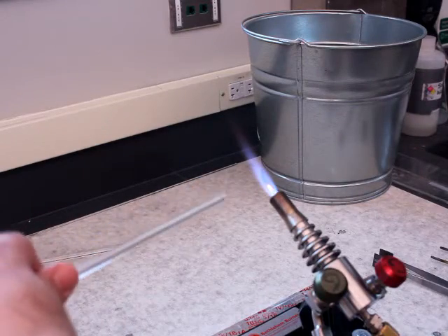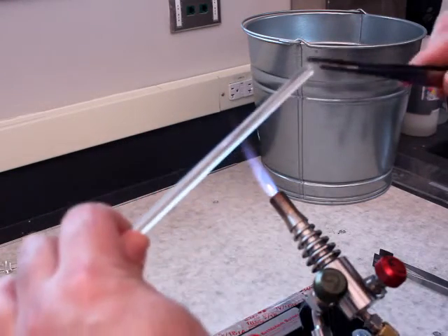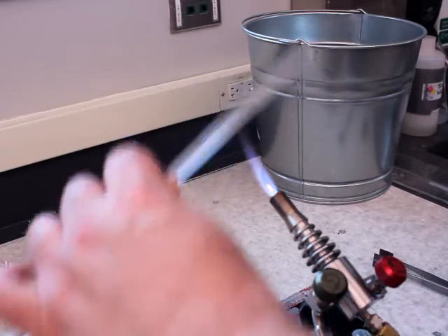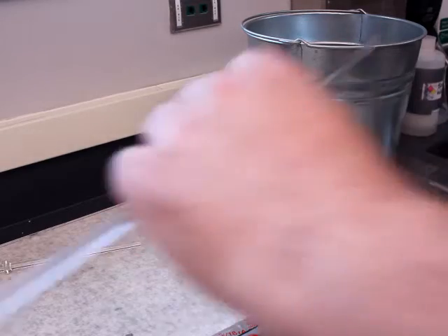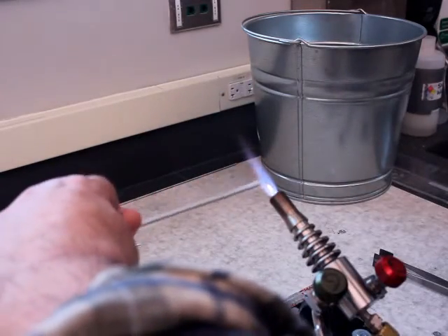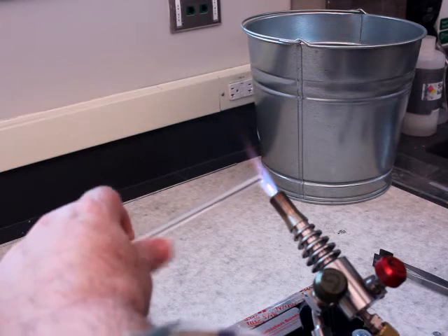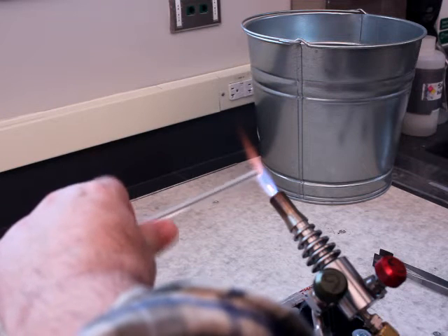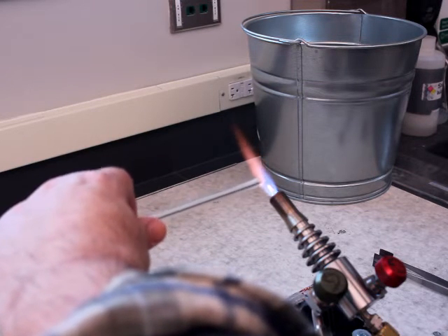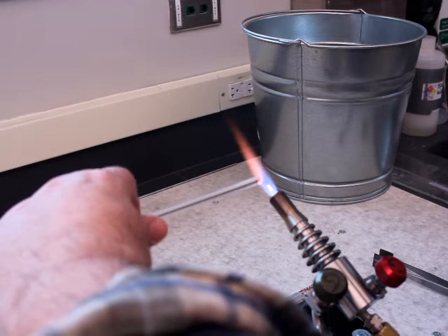Because my waste bucket is to my right, it's easier for me to rotate using my left hand, pull off the waste glass, throw it in the bucket, and then switch hands. I would highly recommend practicing rotations with your non-dominant hand. I am right-handed, so for me it's always good practice to use my left for rotating and keeping the glass where I need it in the flame.